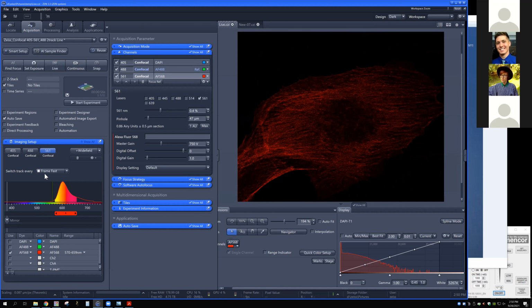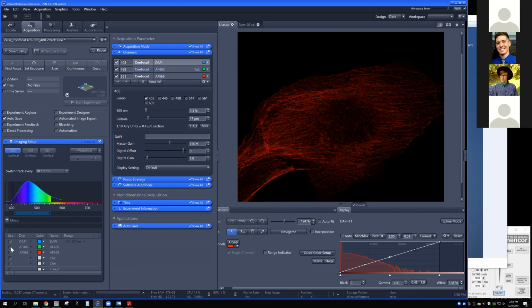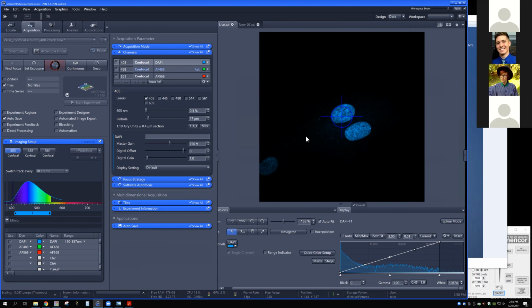And like I said, let's go back here. Let's see if we can actually expand this range out a little bit. And I know, there we go, good. I know I'm running a risk here because my green is in the range that I'm detecting here also. So I could run into problems with that. And we're about to find out as soon as I hit live. Not bad. A little bit maybe.